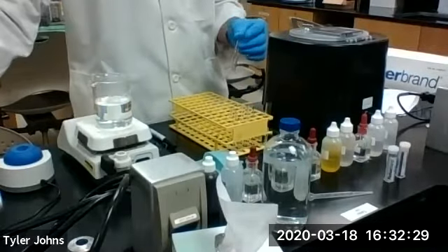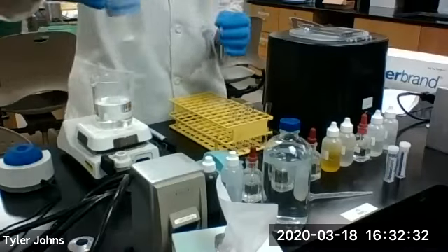Okay, so first we're going to start by adding several drops of our magnesium.